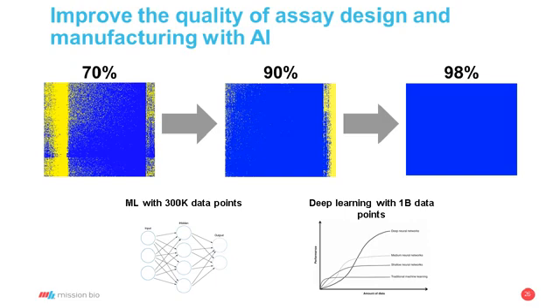The initial panel that we had developed had about 70% high quality amplicons, and 30% were low quality, highlighted in yellow. We applied a simple machine learning algorithm to this fairly large data set, about 300K points, to identify features that are specifically related to quality. And using those features, we go back and re-optimize which amplicons are likely to work best in this multiplexed PCR.